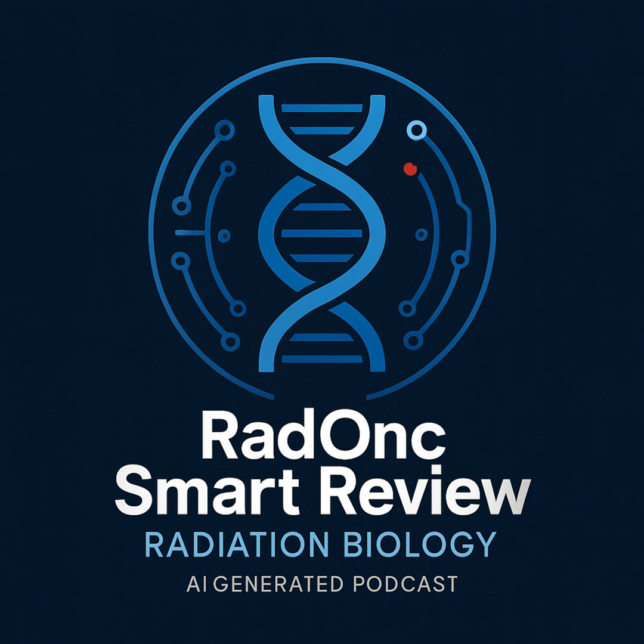So wrapping up, we've covered a lot of ground today. These essential molecular techniques really form the bedrock of modern radiobiology. We hit PCR for amplification, the blots, Southern for DNA, Northern for RNA, Western for protein, the sequencing evolution from Sanger to NGS, and the historical context of RFLP. Then we looked at DNA damage detection with the Comet assay and the specific DSB marker, gamma H2AX foci.